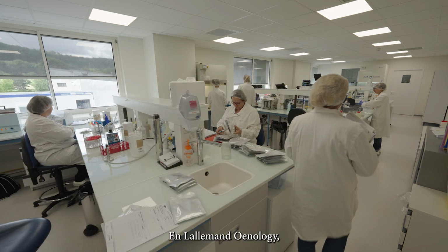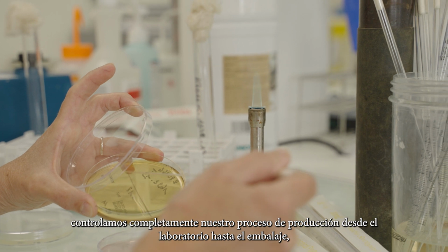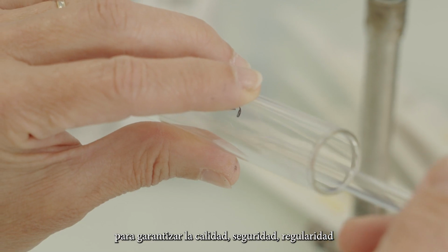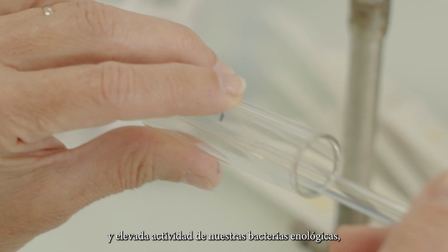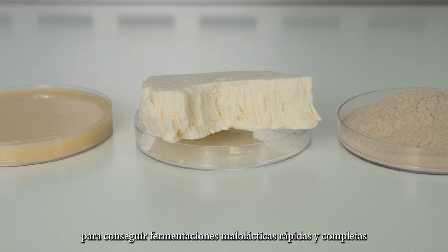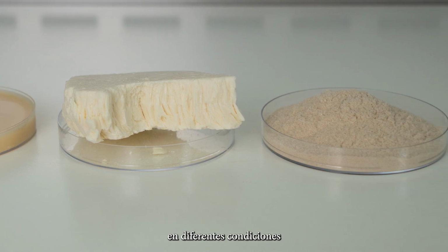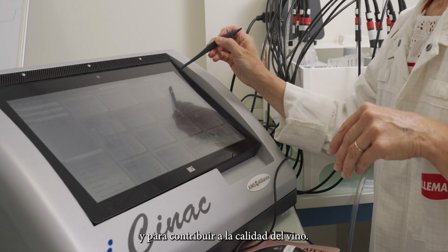At Lallemand Oenology, we fully control our production process from the lab to packaging to ensure the quality, safety, consistency, and a high activity of our wine bacteria to achieve a fast and complete malolactic fermentation in different wine conditions and to contribute to wine quality.